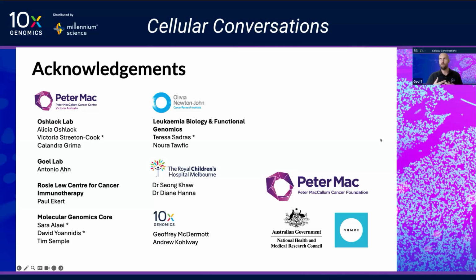Can you use tools like you do for simple PCR primer design, or do you have to go and develop your own software package? So as I alluded to in my talk, we did have to write our own software to do this, and we will make that available when we publish this work. So anyone will be able to grab our package, download it, and design probes to their own favorite fusion.